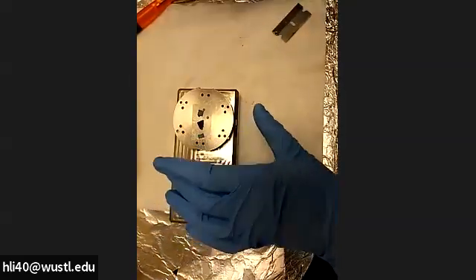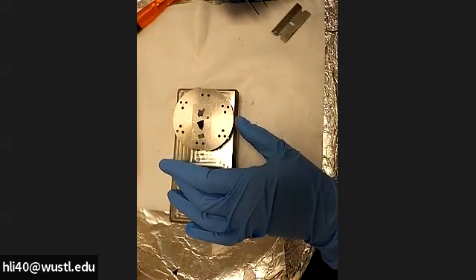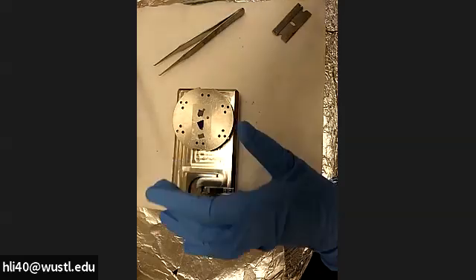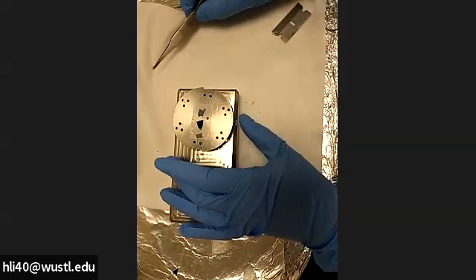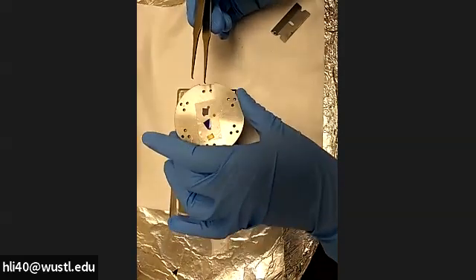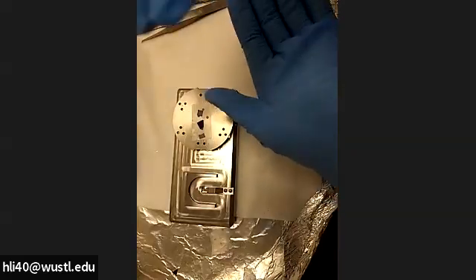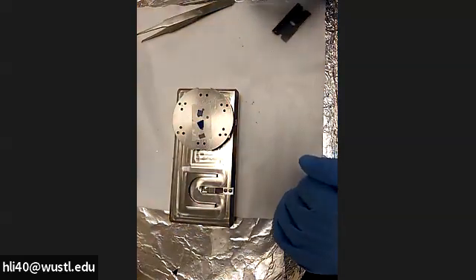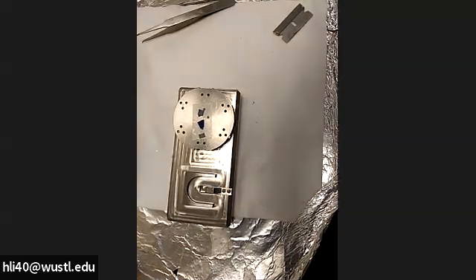I mounted three samples today, but you can mount more — for example, up to 16 samples to take advantage of after-hours or weekend run time. Make sure the sample is secured and won't drop. When mounting multiple samples in one loading, make sure all sample surfaces have similar height — the height difference should be within one millimeter. The detector comes very close to the sample surface, about one millimeter away, so if the height difference exceeds one millimeter, the detector will crash into the sample.